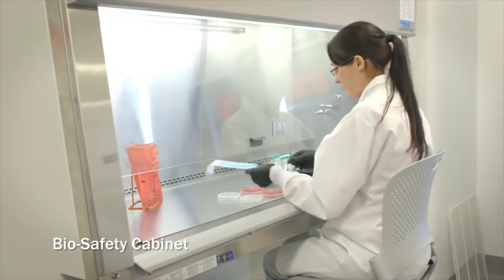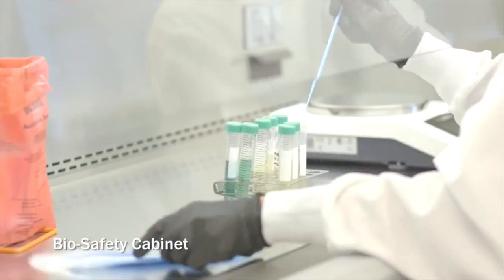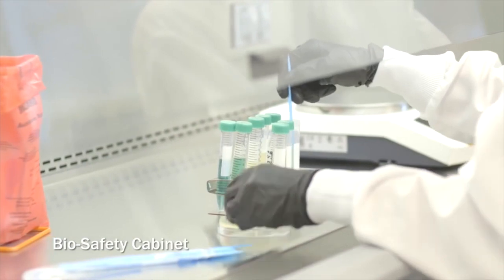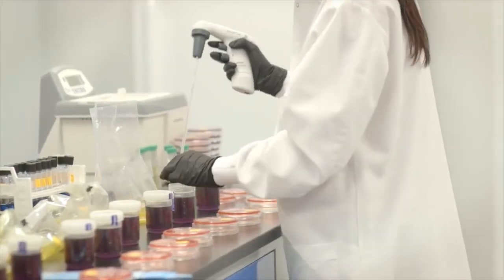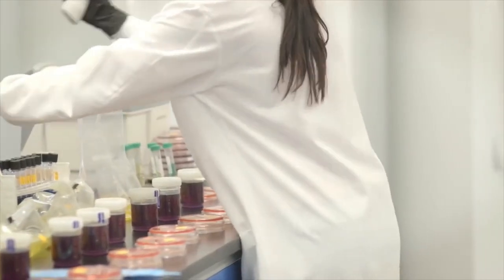The microbiologist will swab and plate each media, and then we'll actually count the plates using specific microbiology techniques. From these tests, we can actually measure the contamination that has been possible in any part of the manufacturing process, all the way back to distillation.